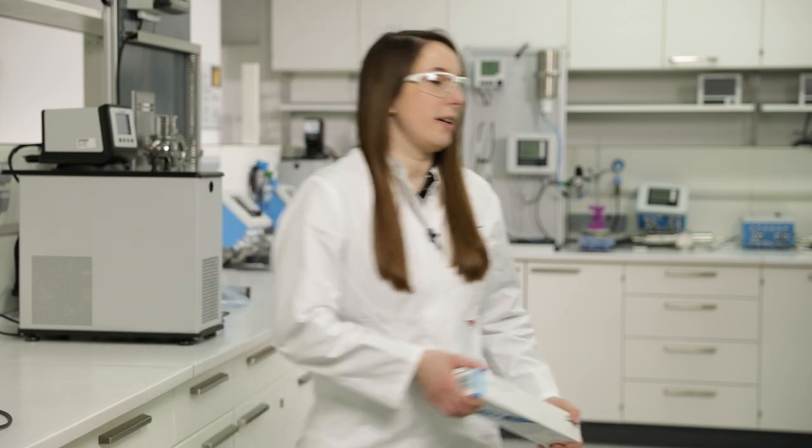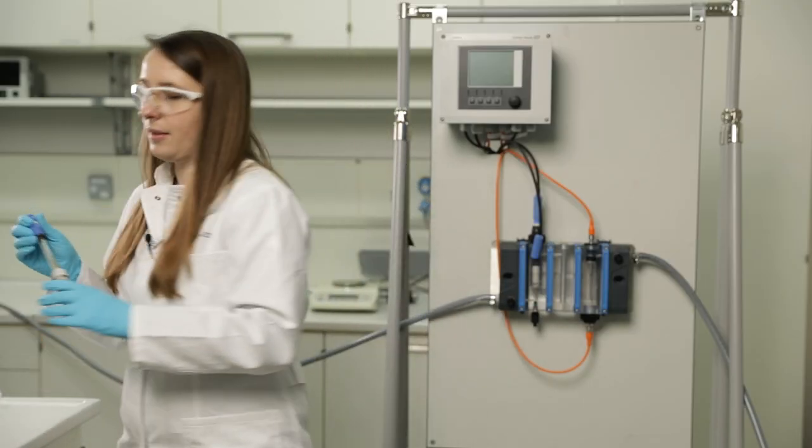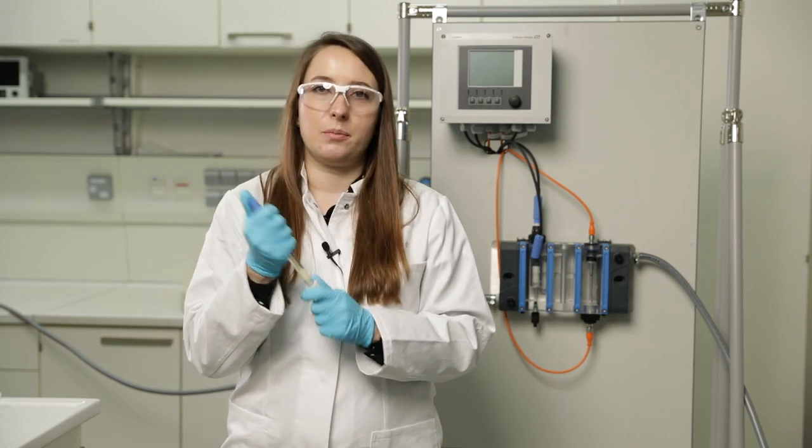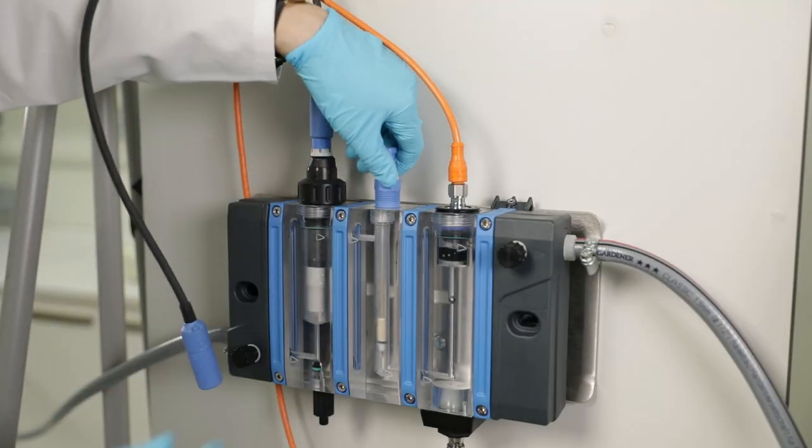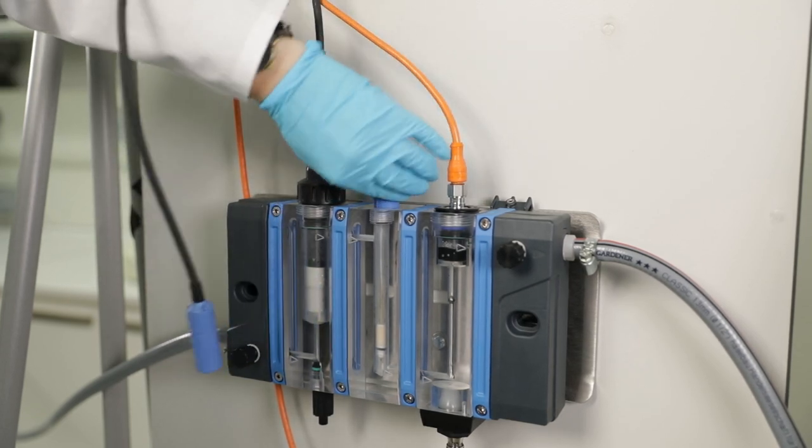For the second step, you have to go on-site. Take the sensor, remove the KCL cap, mount it into its assembly, and connect the Memosense measuring cable to the sensor.